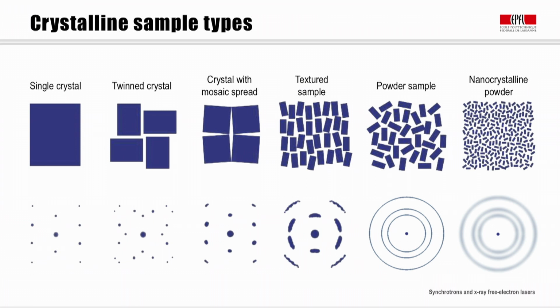When the characteristic size of the individual grains is reduced to only a few unit cells, such as in nanocrystals, the widths of the diffraction peaks broaden accordingly, producing diffuse ring patterns. This lower limit in crystallinity often best represents the grim reality of real systems, and as such is actually a burgeoning area of research in 21st century crystallography. Synchrotrons are playing a leading role in this enterprise.